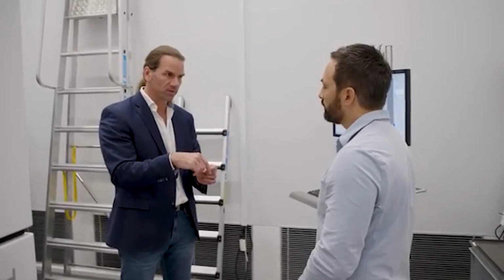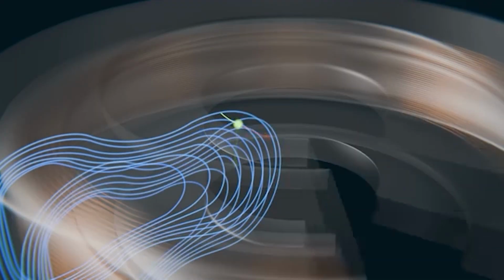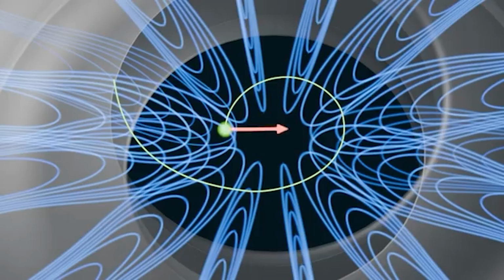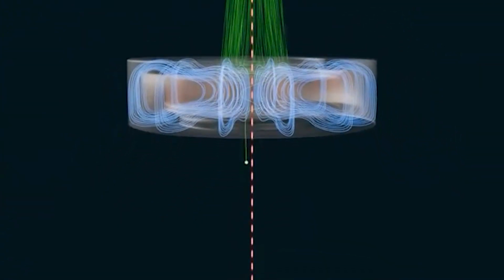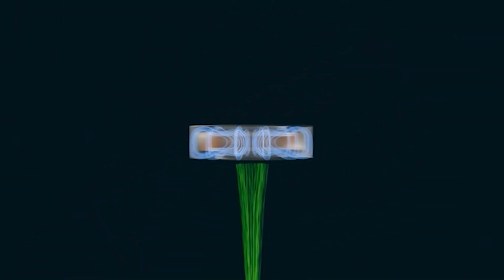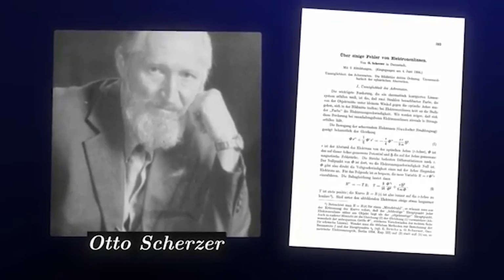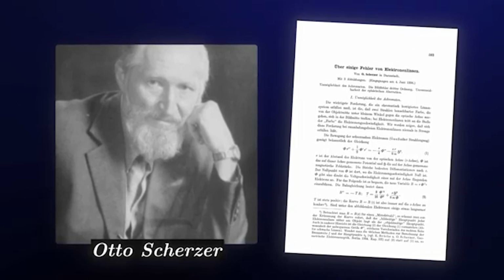So the electrons will always cross through two lines. The first time it passes through, by the Lorentz force, it's brought into a spiraling motion, and then the second time, from that spiraling motion, which has then a slightly different direction, it's pushed towards the axis. That's why all electromagnetic lenses, by default, will converge the beam and never diverge it. Even if you shot electrons in from the other side of the lens, they would still get focused. This is what Otto Scherzer's paper proved in 1936, stopping progress on the TEM. It is impossible to produce a radially symmetric magnetic lens that diverges.